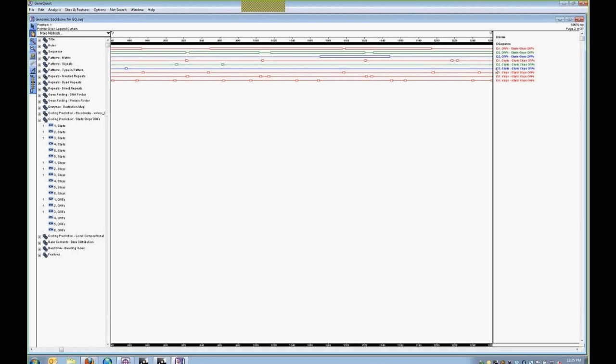Now you'll notice that they have all shown up as red. By default, whatever the last color that you set to your methods is going to be the color that's applied to any methods that you add from here. We can easily modify the color of each method simply by right-clicking on the method and going to line color and then say changing it.